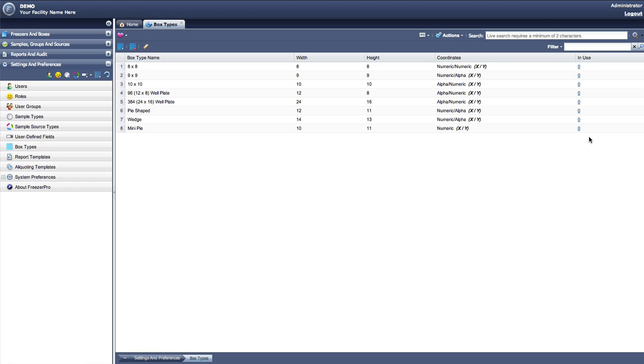This concludes the general configuration managing box types video tutorial. Up next, we will discuss managing report templates.